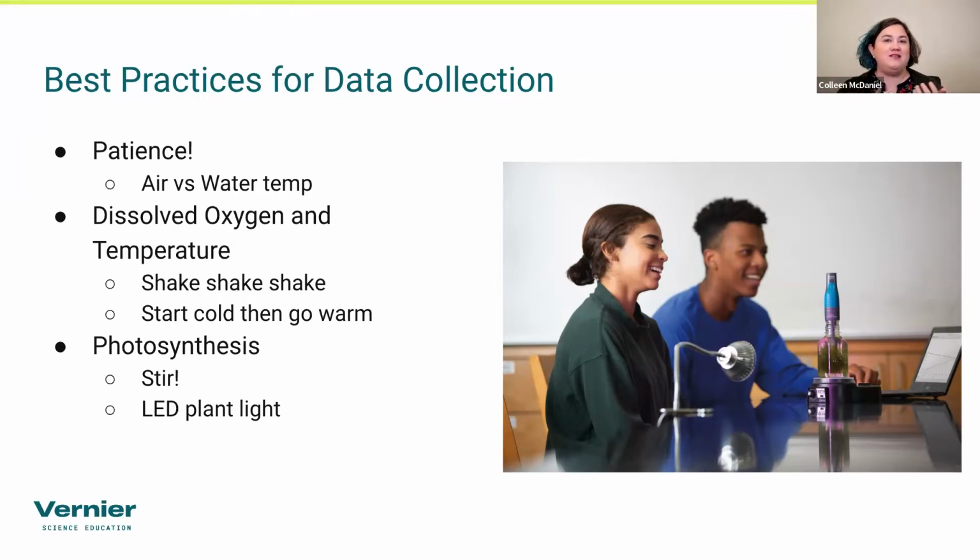Because dissolved oxygen is so temperamental and really tightly related to air temperature and water temperature, you have to think about it: if I'm taking a water sample from a stream that is reading 11 degrees Celsius, for example, because a lot of our streams here in Oregon are around that temperature, but my DO probe has been sitting out in air that's around 32 to 35 degrees Celsius, that's a big temperature difference.